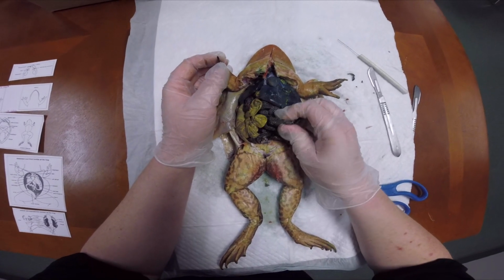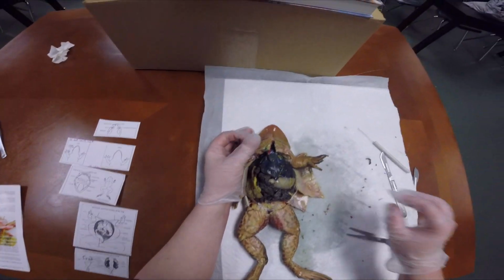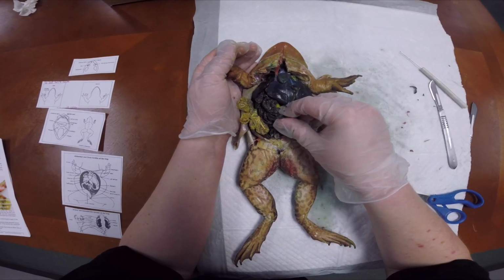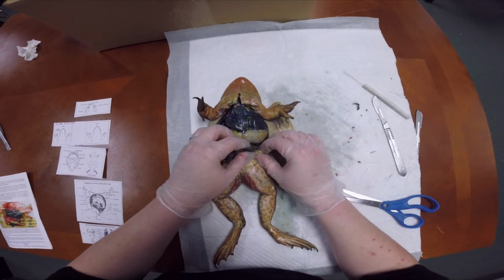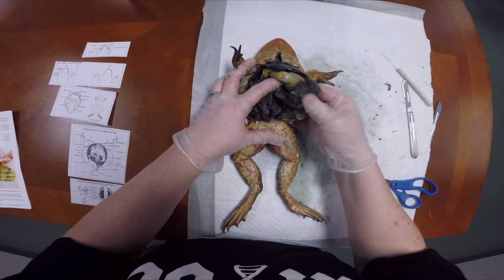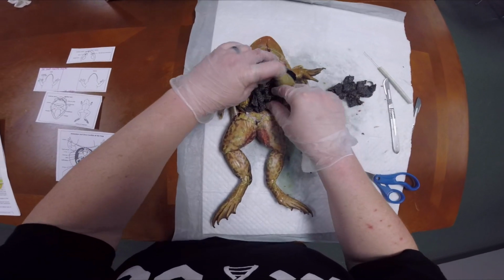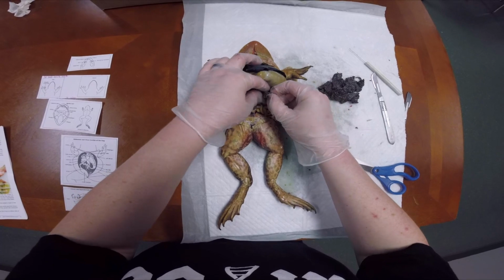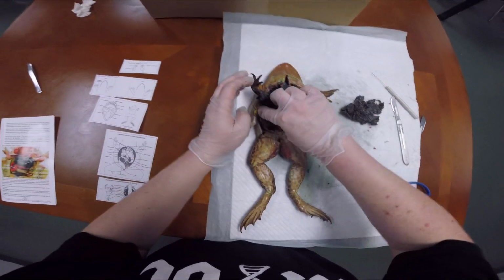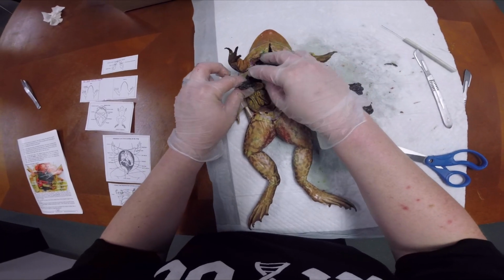All of these that you see here are eggs. So what we need to do in order to see all of the good stuff on the inside is we need to remove those eggs the best we can. So I'm going to take my fingers, I'm going to find the bottom part. That is a bunch of eggs. And then you're just going to pull those guys out. Try to get as many as you can without messing up any of the inside parts. That's a lot of eggs. Check it out. So this one's definitely female.